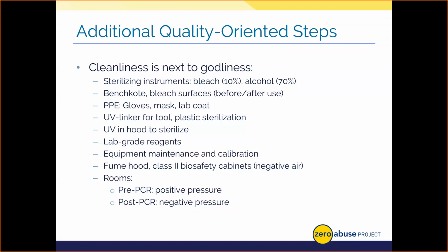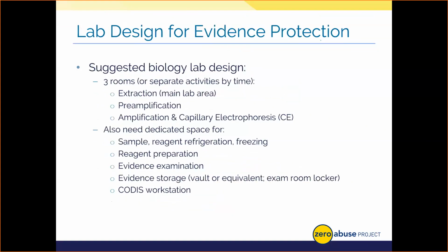So in a post-PCR room, that's after amplification or capillary electrophoresis, I want negative pressure to keep large quantities of that extra copied DNA from getting out to those areas and contaminating other pre-PCR samples. Some equipment actually incorporates airflow considerations, like our fume hoods and our biosafety level cabinets too. So just keep that in mind.